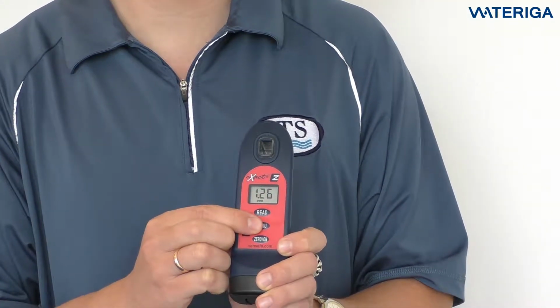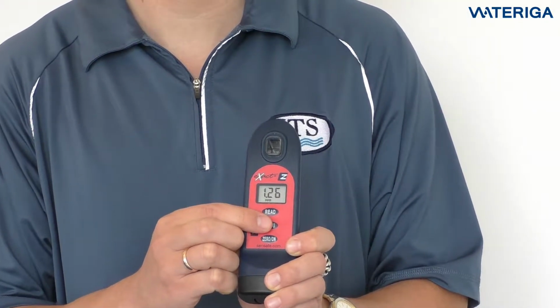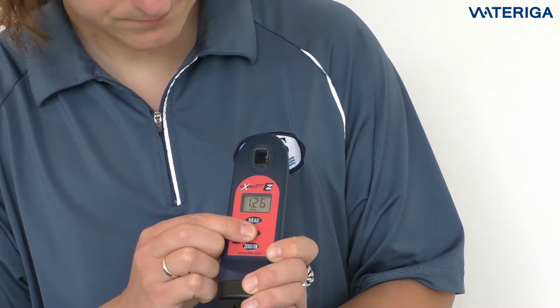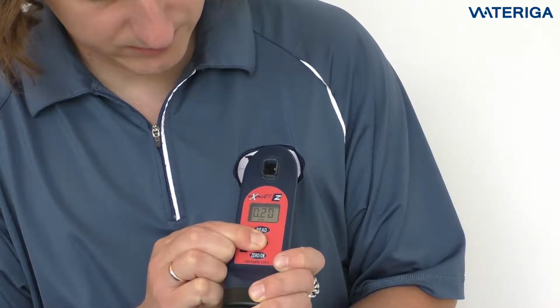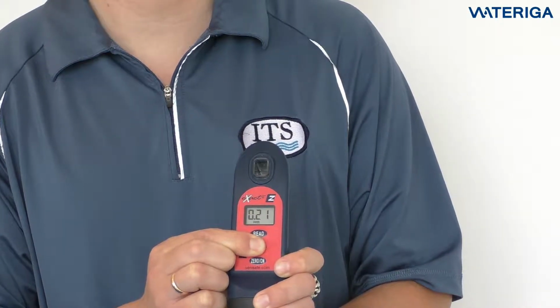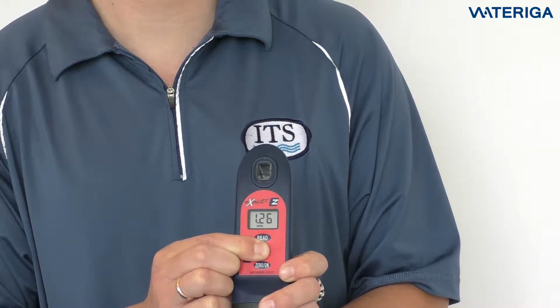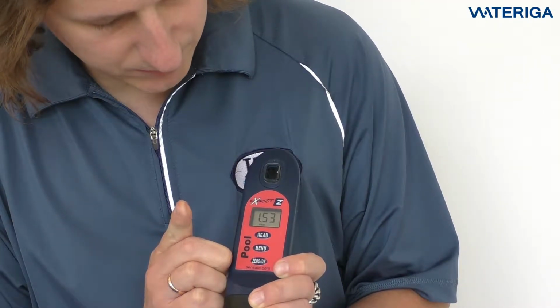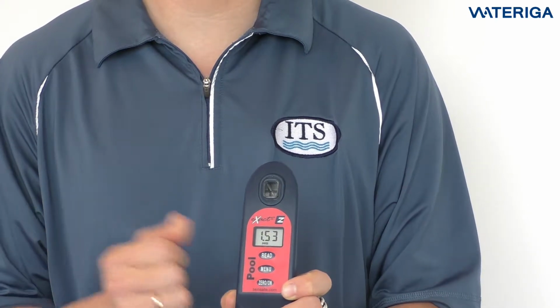If we're going to press and hold the menu button down now, it will count backwards the results that we just did, starting from the latest and going back to the older ones. So first we're going to press it down, and then it shows the 7th reading, and the 6th reading was that, and the 5th reading was that. They go backwards because we did free chlorine, combined chlorine, and total chlorine. First one was total chlorine, then combined chlorine, then free chlorine, and so forth. If we want to stop, we can release the button and it will hold and stop at the result that was shown last.